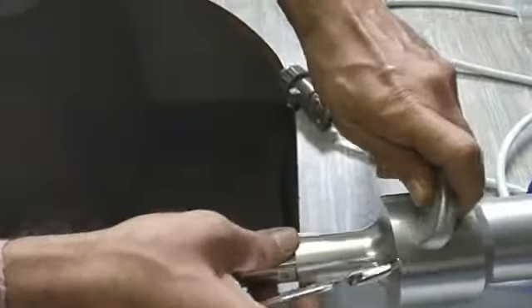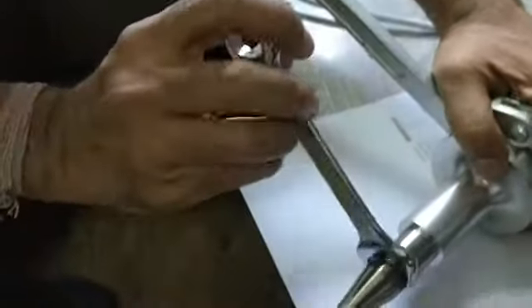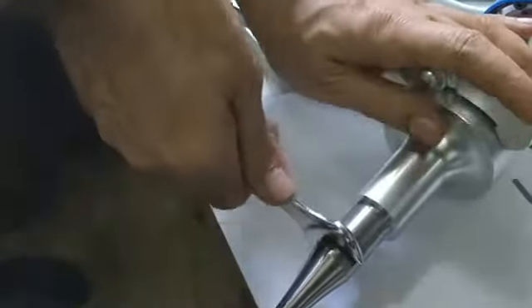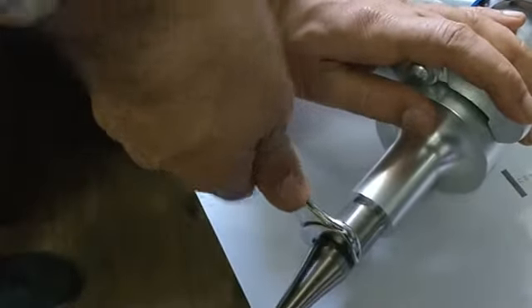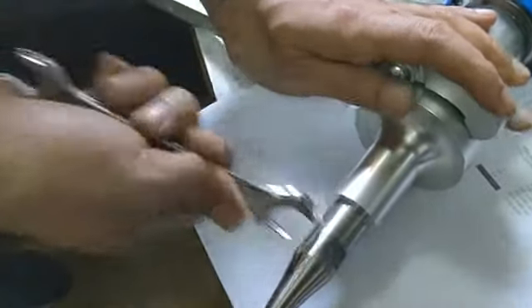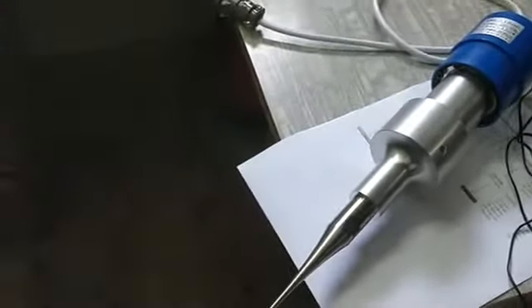Now we will have to change the direction of this if we are tightening it. We will make it in this direction, and now we will tighten it. Make sure it is tight properly. Now we have changed the probe from 6mm to 2mm.